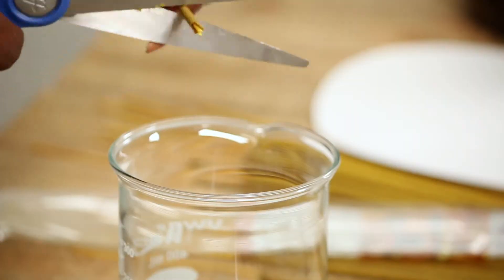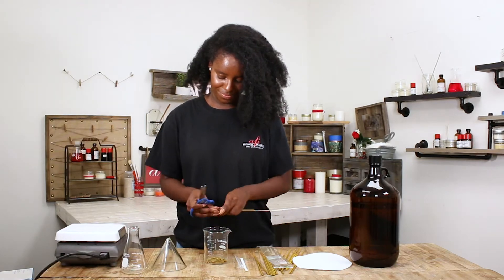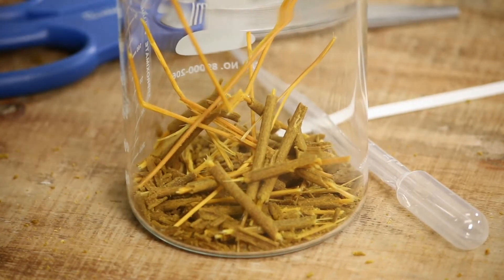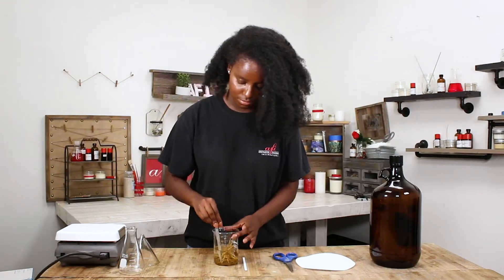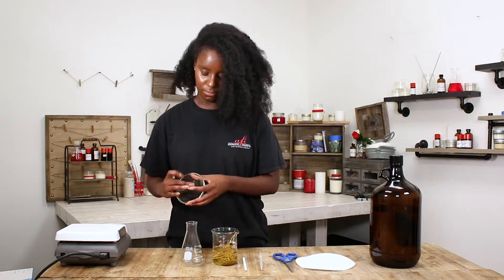We're gonna start off by cutting the incense sticks into little pieces and dropping them into the beaker. Next, we're gonna pour pentane into the beaker and make sure it covers up the incense sticks. Stir it with a pipette and leave it in for about one or two minutes.